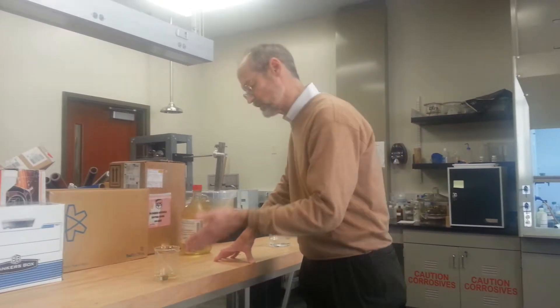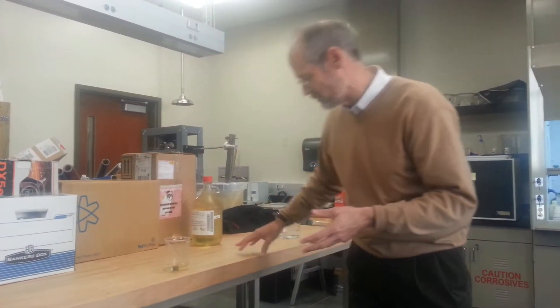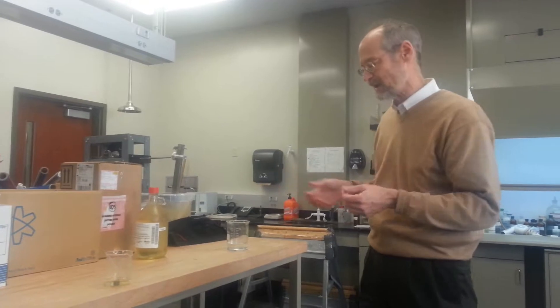So I'm showing you this with this glass rod and you're thinking, well, okay, I don't really get it. So that's why we need Part B of the demonstration.